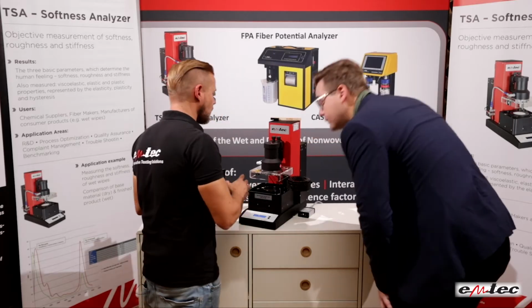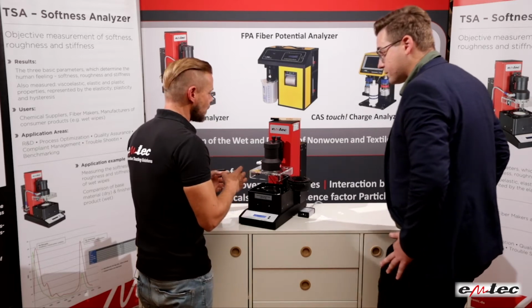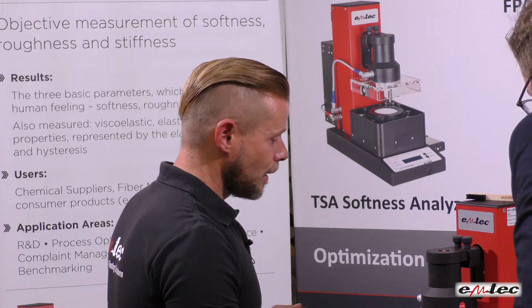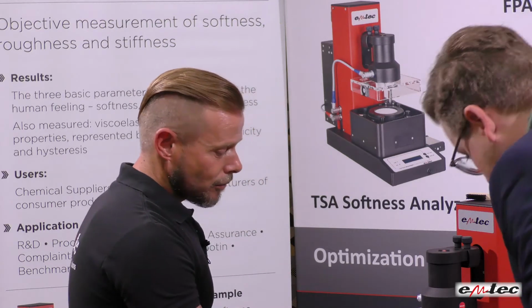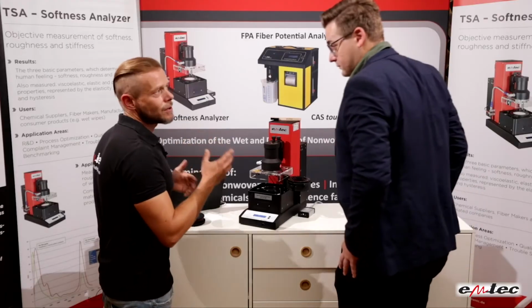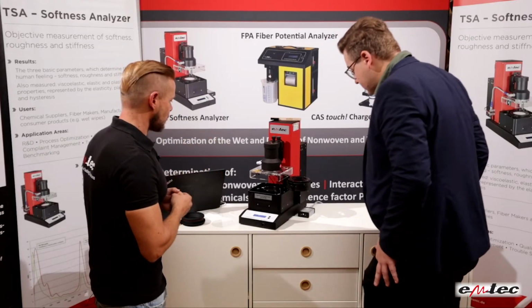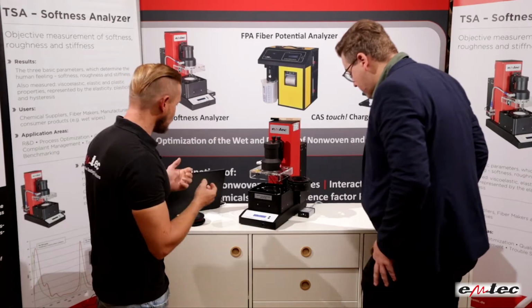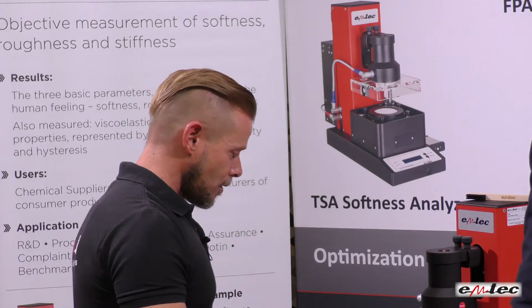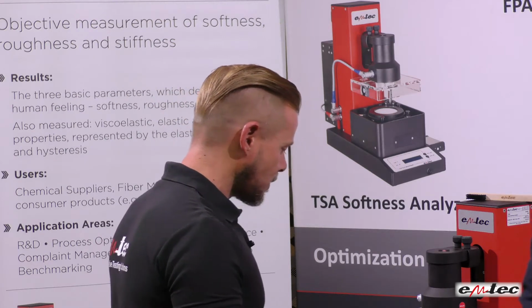load cell, because not only noise or sound, but also the load or weight that we put on the material is important for the measurement. And then you have a third microphone. It's a noise cancellation system where we make sure that environmental noise is not influencing the measurement results. Now, when we start the measurement, the first step is the measurement of the roughness or macro surface variations.